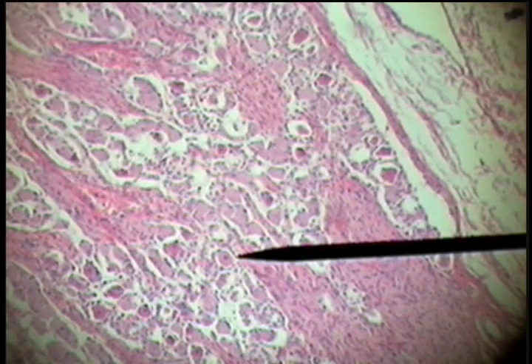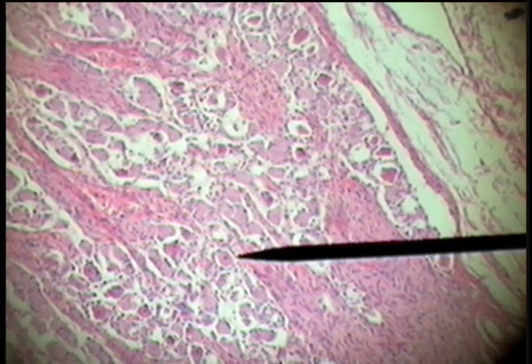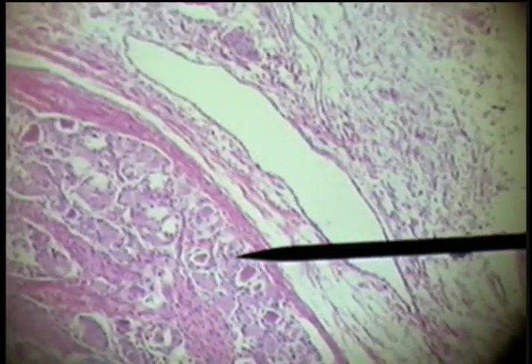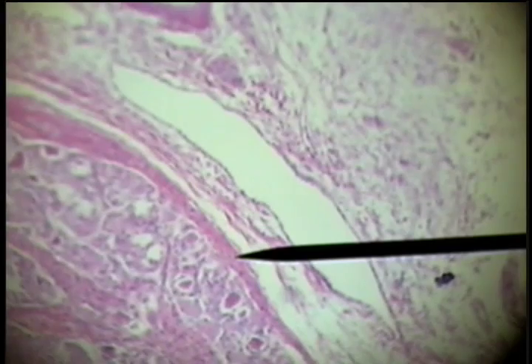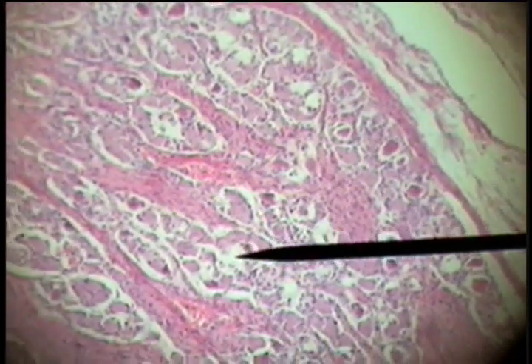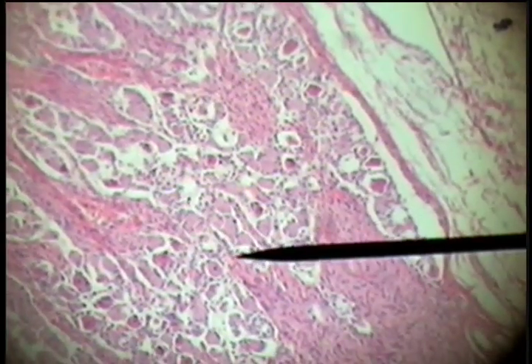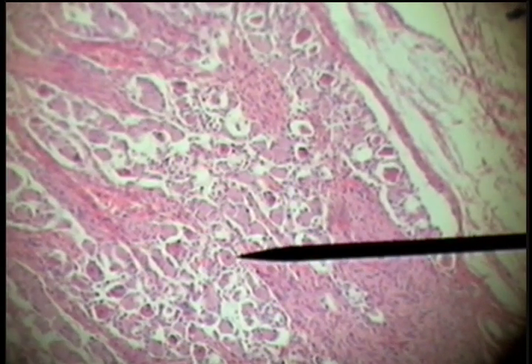The dorsal root sensory ganglion is located on the exterior and the dorsal portion of the spinal cord. It has a fibrous connective tissue capsule around the outside, and the cell bodies located within that capsule are called owl eye cells.